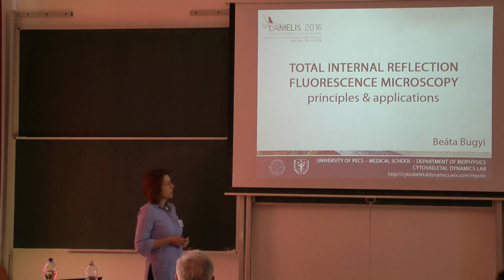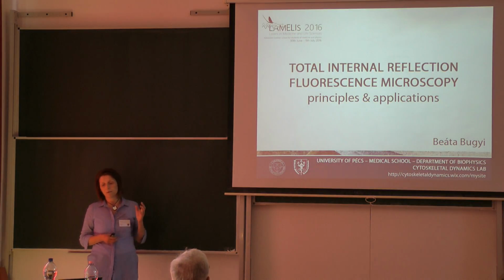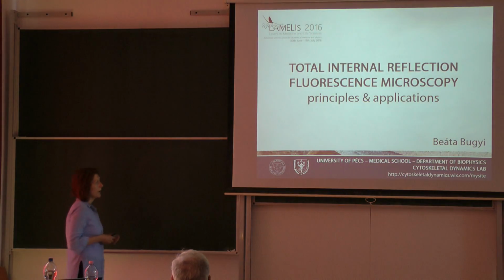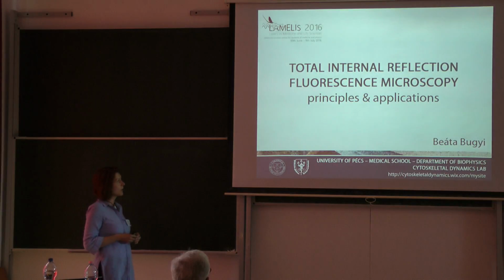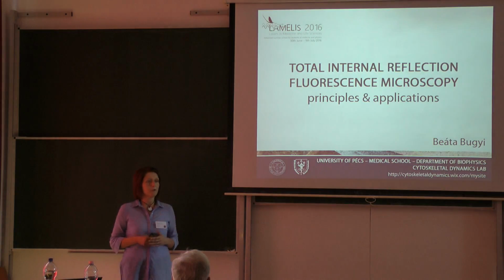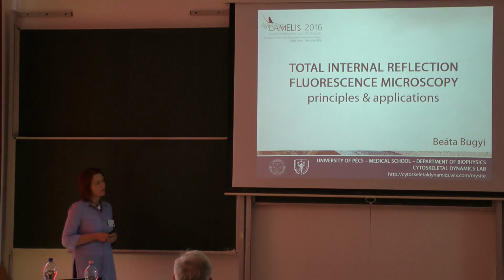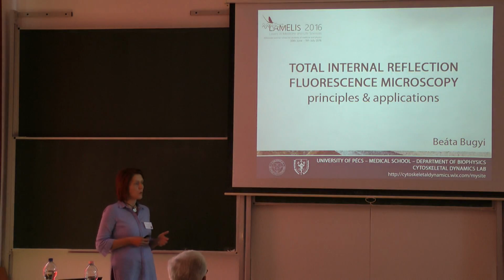Actually, I chose one of the techniques that we routinely use in our research, that is total internal reflection fluorescence microscopy. This technique is based on the unique evanescent field that is formed upon total internal reflection of the light incident to the boundary of two media with appropriate refractive indices, and it provides a better resolution than what we can expect from standard fluorescence microscopes.